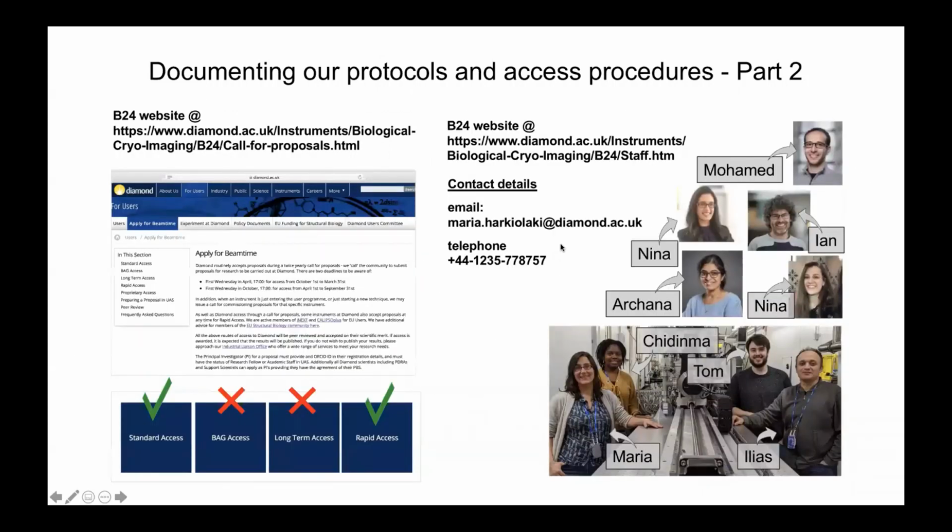And in the same spirit, to access all this, how do we go about actually using it? All of this is documented again on our website. The Beamline is accessed through proposals, either standard access or rapid access, and clearly through collaborations with us. Standard access involves putting in a proposal, it goes through peer review, and then it's allocated time. And with time comes us also, because we help with sample loading and data collection. Then it's allocated specific shifts or time on the instruments depending on their scoring. And then there's rapid access, which is much faster. It gives smaller times, but it's there for feasibility experiments.